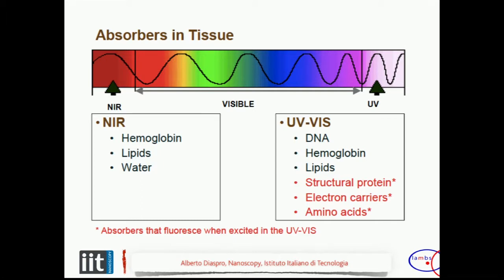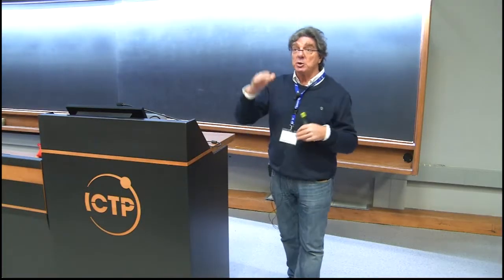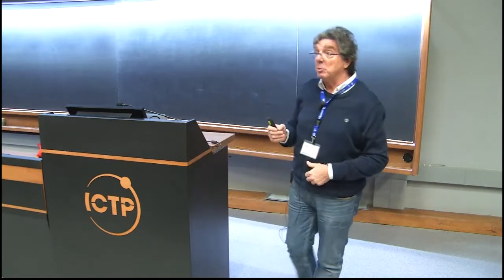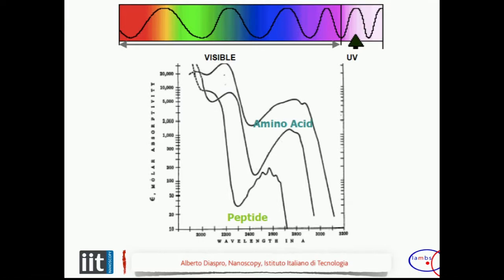Of course, we like, not from the microscopy point of view, but from our living state point of view, that the biological macromolecules we have inside do not absorb light, otherwise our temperature under the sunlight would increase too much. And you know, or probably you know, that within this window, you want to avoid shining light on your system in the ultraviolet because you have 220 and 260 absorption of protein and DNA. And so in case you shine light there, you can change their structure and so the functioning.